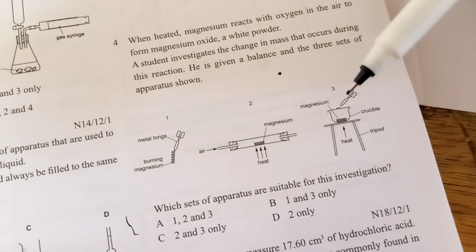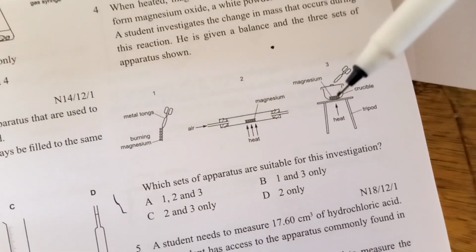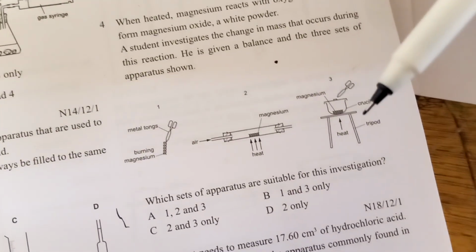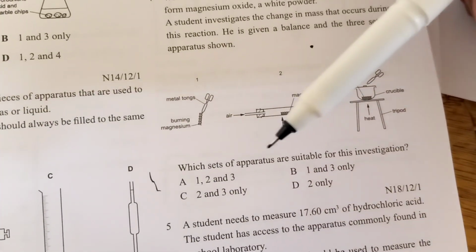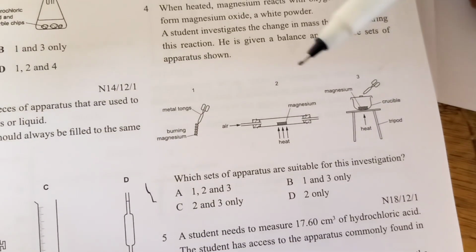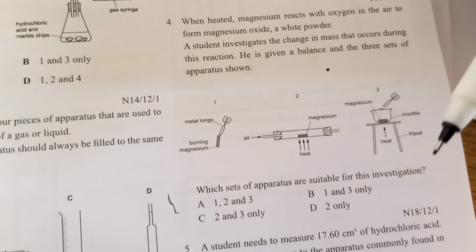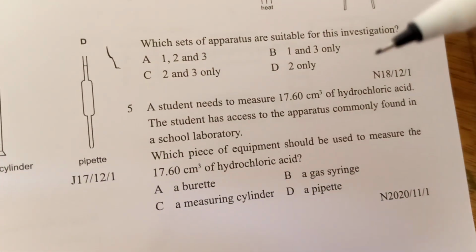Why do we have to remove and put the lid? We prevent the white ash from moving outside, to prevent loss in mass. Okay. Now, which set of apparatus is suitable for this experiment? It is 2 and 3. Now look at this question. Stop the video and try it if you want.